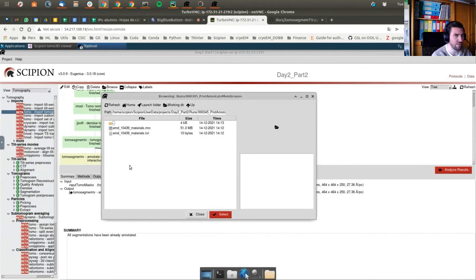No. Oh, did you click on Save Materials? No. Did you close the... Yes. No. No worries. Sorry. No worries. Everything's fine. Can someone connect to Tamara's machine and open? I was so happy that everything worked that I forgot to press save.